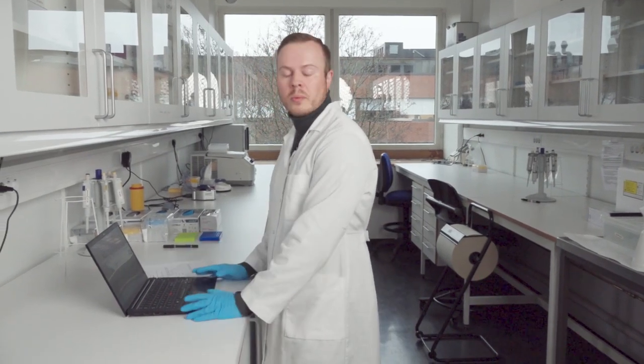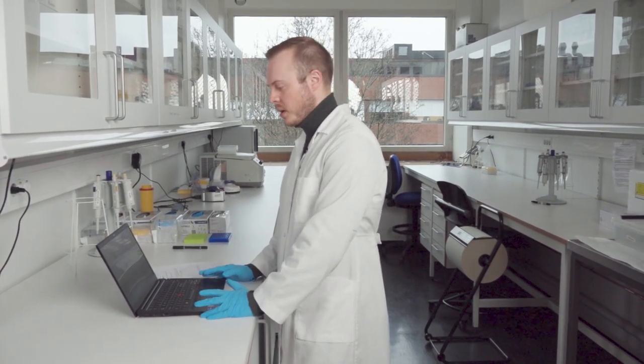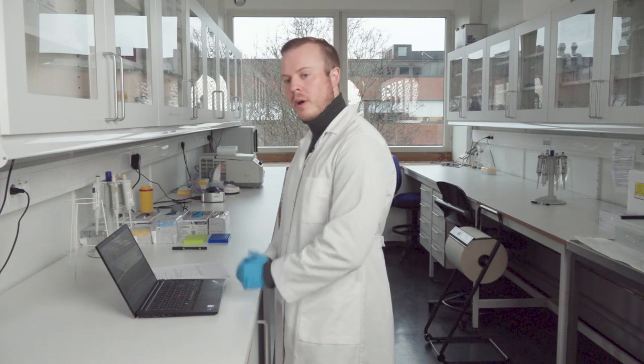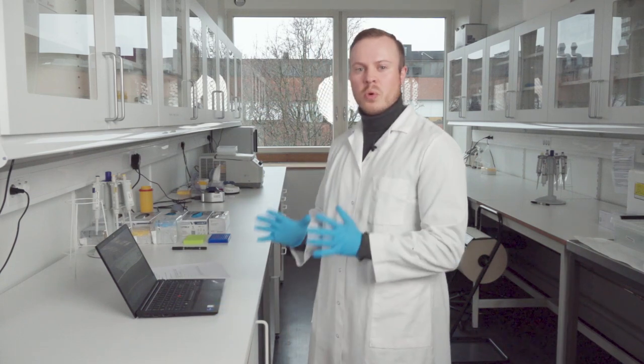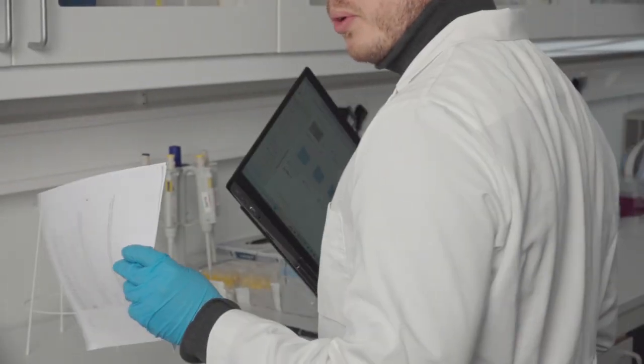Now that you are familiar with all the theoretical steps in the procedure and have completed all the necessary training, we are ready to start the actual practical work. The most important thing for working in the lab is to have a clean and tidy working space, so we move the computer and the protocol to make room.